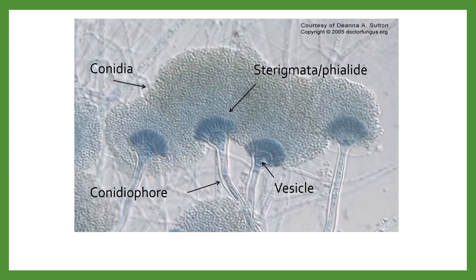Here we have a microscopic examination of Aspergillus with the stain known as lactophenol cotton blue. You can see all the spores — the little circular structures known as conidia — then the sterigmata, which are the little hands that hold the conidia, then the bulbous section called the vesicle, and below that the long tubular structure called the conidiophore.